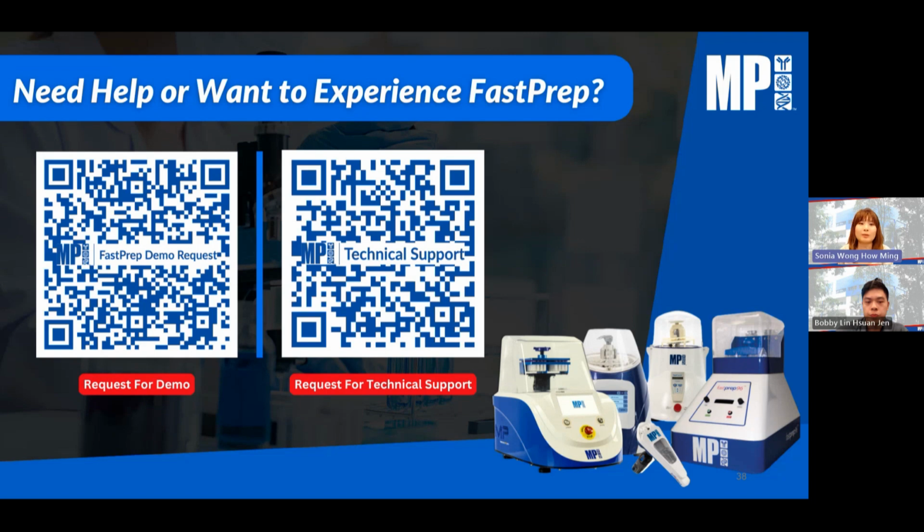This is similar to my case study one when we talk about fungus, as proven by that case study as well. They have successfully gotten the proteins. They were not just looking at one enzyme, but at proteins, and they have profiled the proteins after using fast prep to homogenize and get the total proteins from these fungal isolates of different strains.